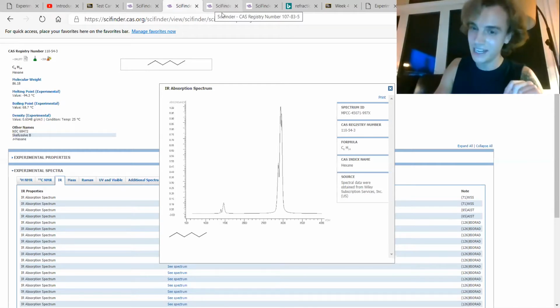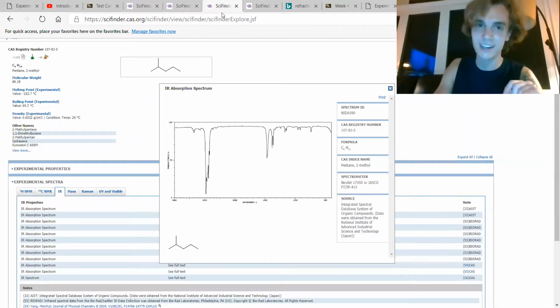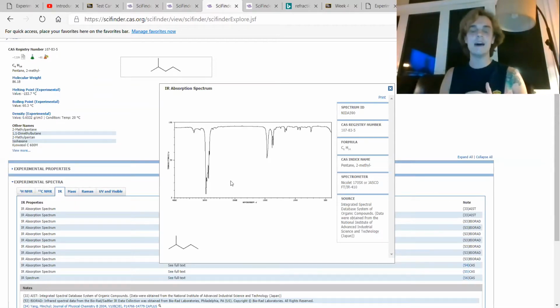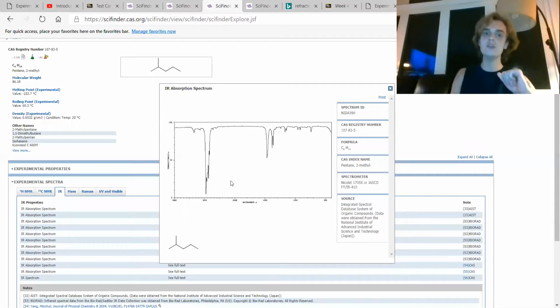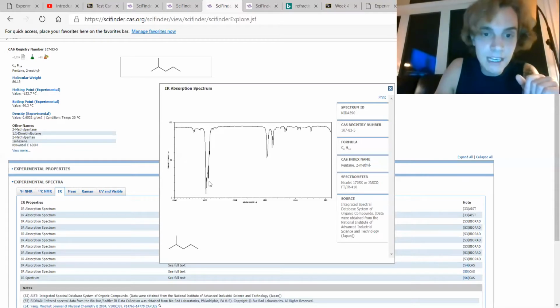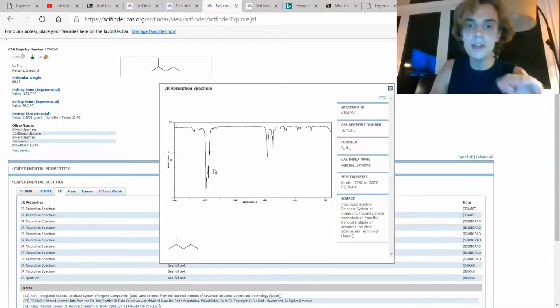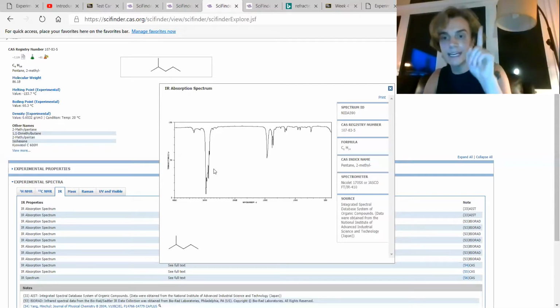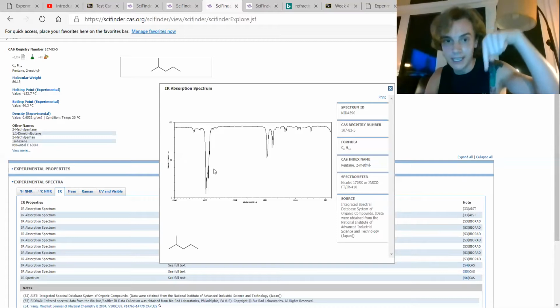Just something to note and definitely put in your report, which I will grade you upon. And then here even further, we have the same molecular formula, 6 carbon atoms, but instead of a cyclohexane or an n-hexane organization, we have 2-methylpentane. So we have 6 carbon atoms arranging themselves in a pentane figure with a methyl branch, and we have an even smaller peak here. I know that they switched at one point, meaning you used to see peaks pointing upwards, and now you see peaks pointing in this direction.